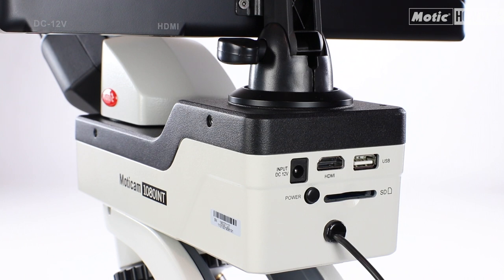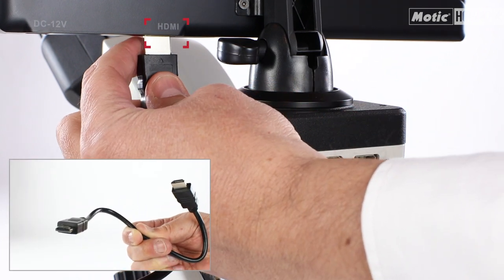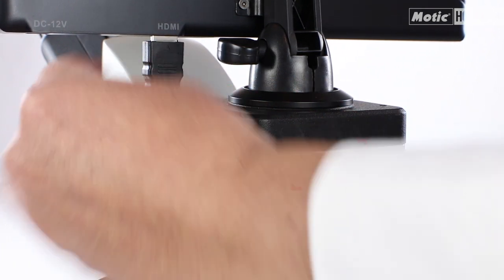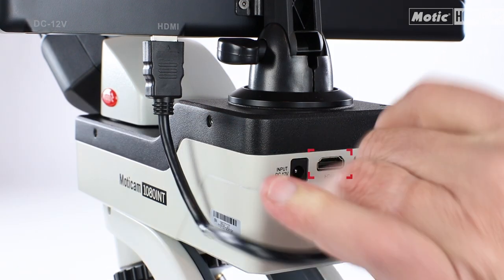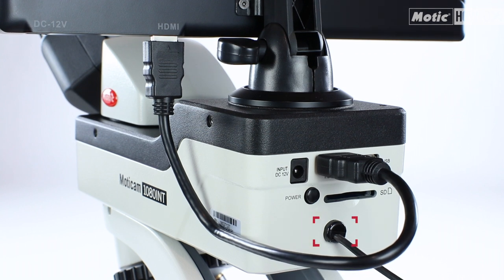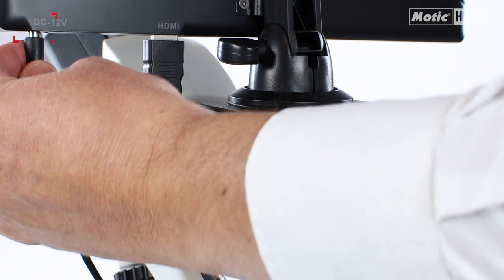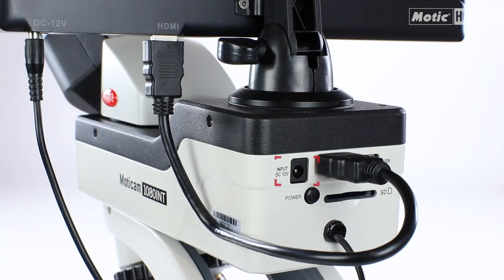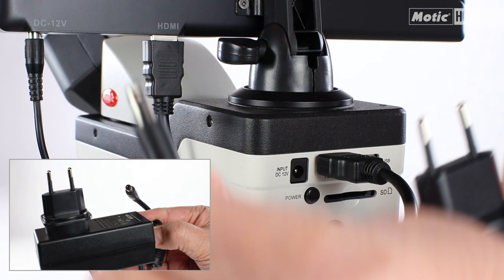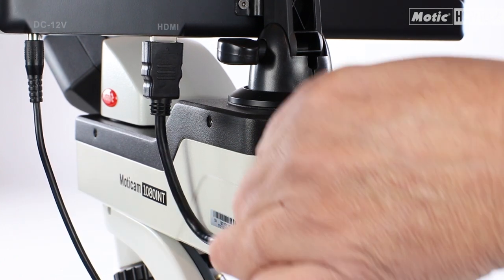Once the set is assembled, we will proceed with the connection of the cables. First, connect the HDMI cable to the HDMI port of the screen and the camera. Also connect the cable coming from the bridge to the 12 volt socket of the screen. Finally, connect the power supply to the 12 volt socket of the bridge.